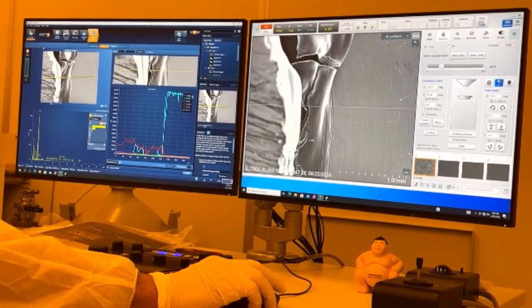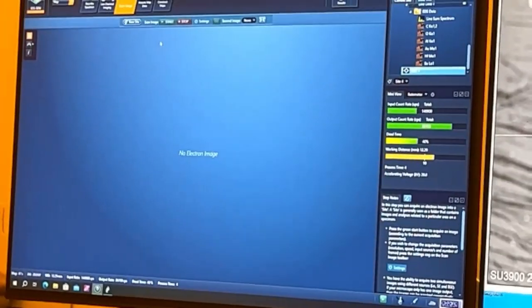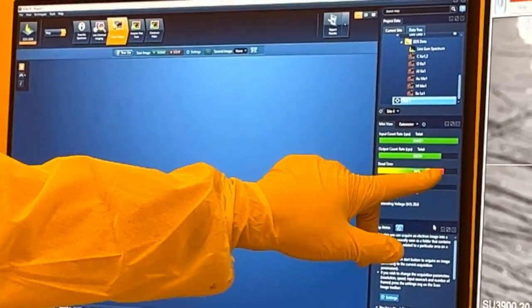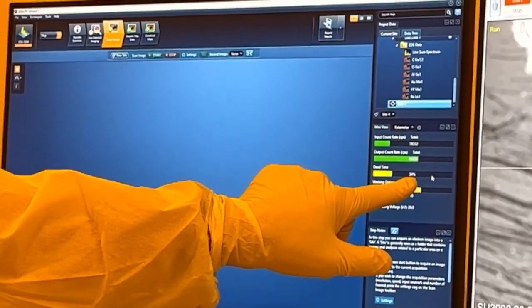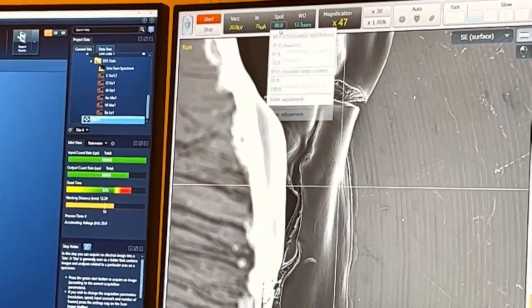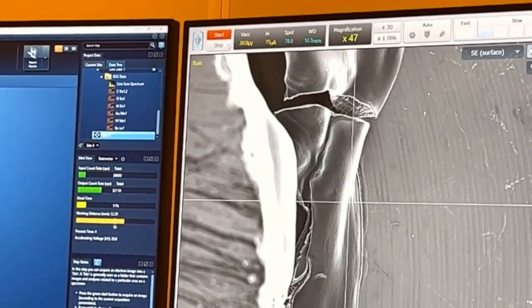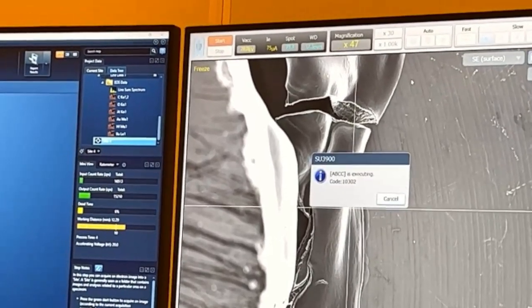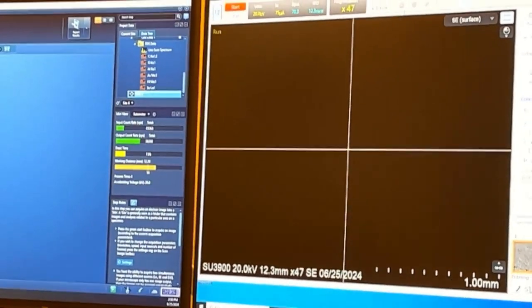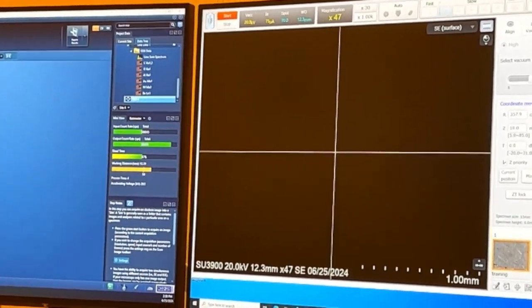And then I'll show you the map. So we'll do a new site. So you actually see our dead time is now in the red. It depends where the beam's scanning, that's why. So we can turn this down. So you turn the spot size down? I turn the spot size down, yeah. Oh, you know why we don't have a live image here? Because this still has scan control.